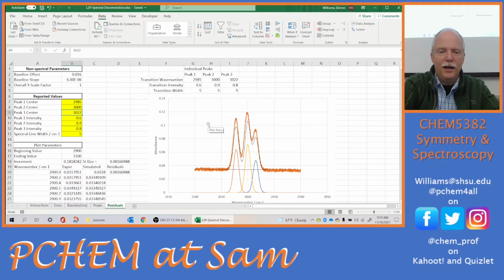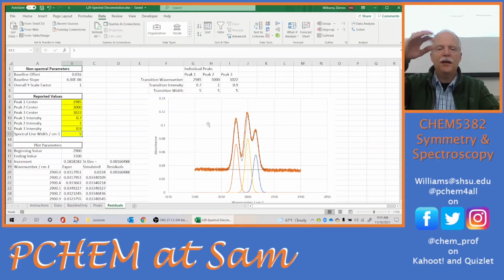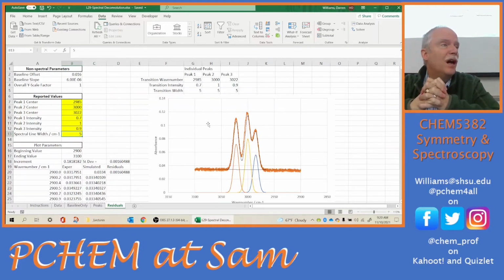Okay. So that looks pretty good. They're not quite high enough, and so maybe I need to come down here and increase their height, maybe 0.7. That looks pretty good. Instead of 0.9, let's go to 1. Okay, that looks pretty good. Instead of 0.8, let's go to 0.9. So you see, I could play around with this and eyeball it, but when do you stop? How do you know how good it is?